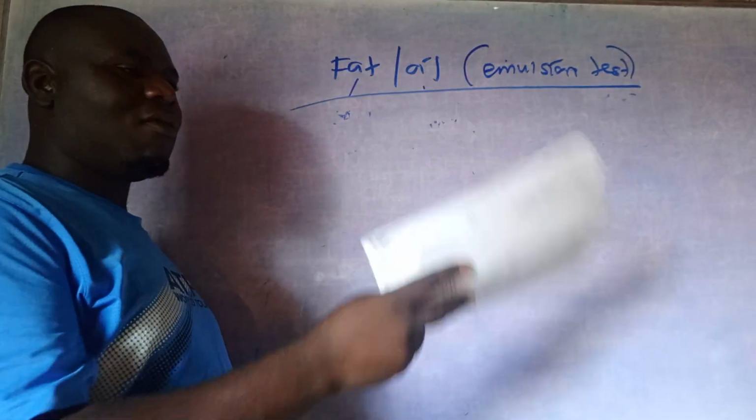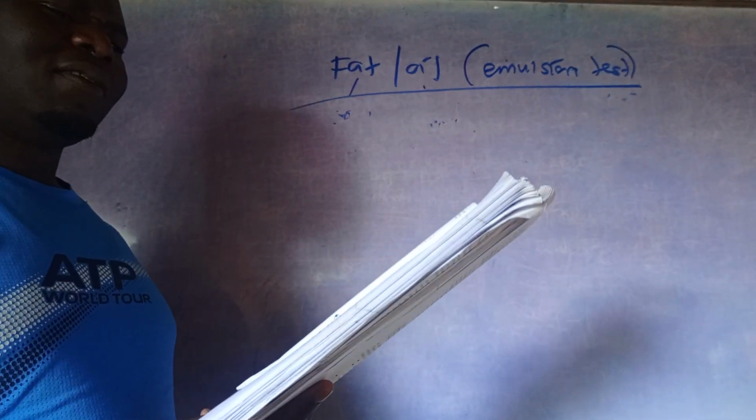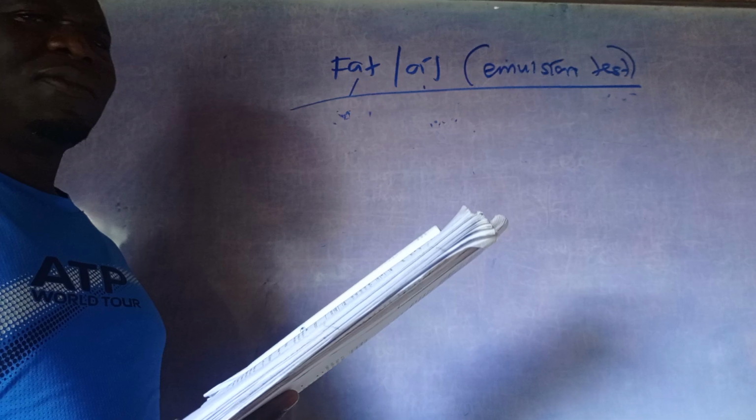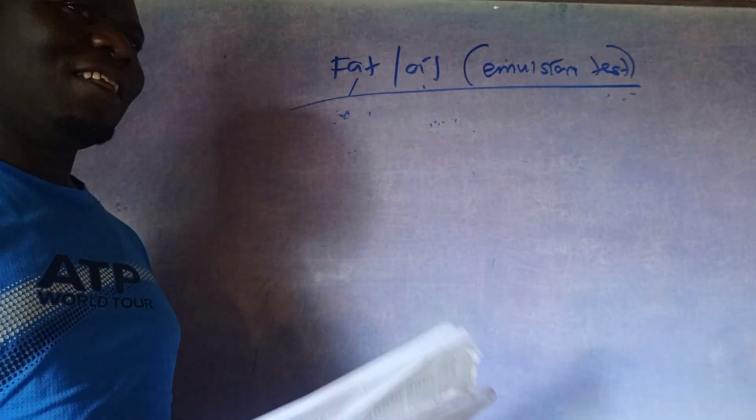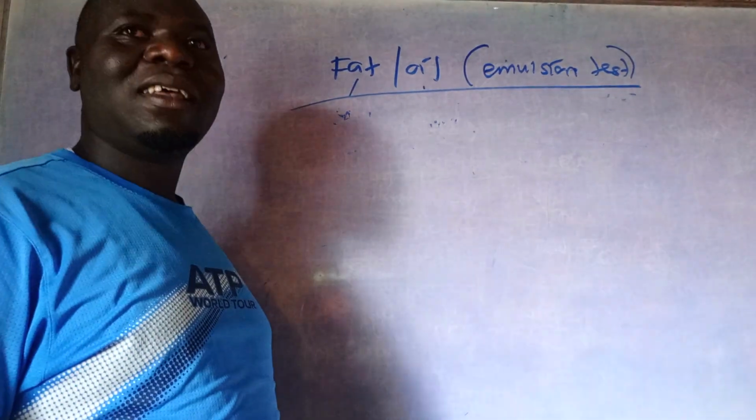Then now, if it disappears, that's okay, it's absent. But if the permanent, translucent, or grease or oil spot is formed, that's what is present. You go and write now present. All together, family. Very clear?